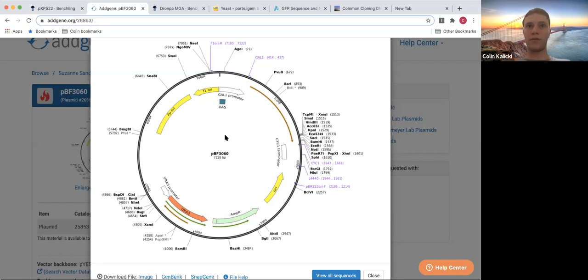Because let's say you have 4 different plasmids, you're trying to transform this certain bacteria, maybe a ton. If your origin sites aren't unique enough, then the plasmids are going to kind of be undefined. They're only going to replicate kind of willy-nilly. That's origin sites. Very important. But like I said, usually those are kind of baked in, and you can find a library for those. And so the plasmid I'm using today will already have the origin site in, which is really nice because a lot of people do a lot of good thinking about that.